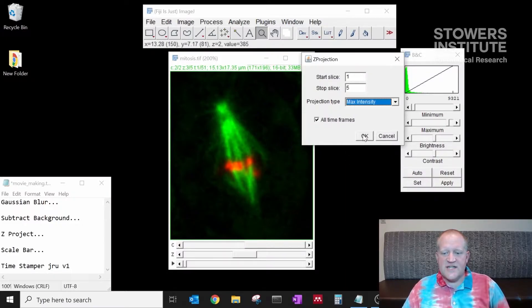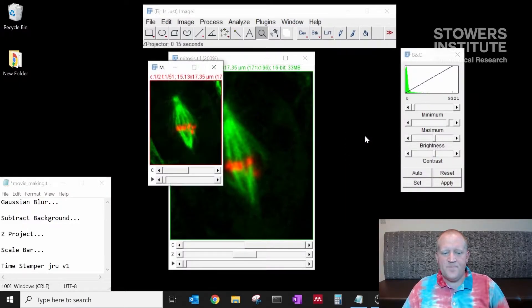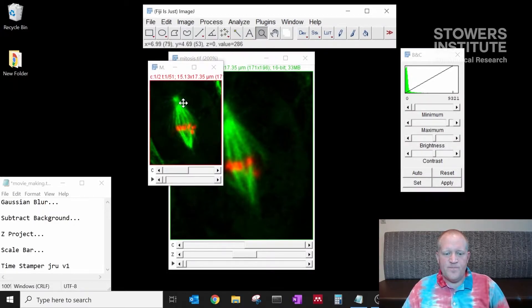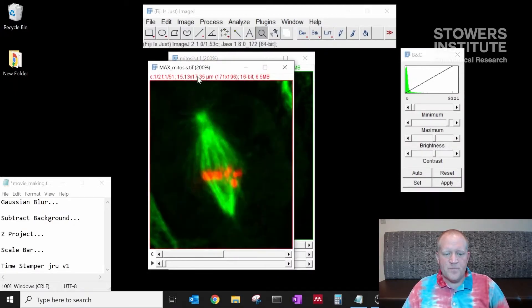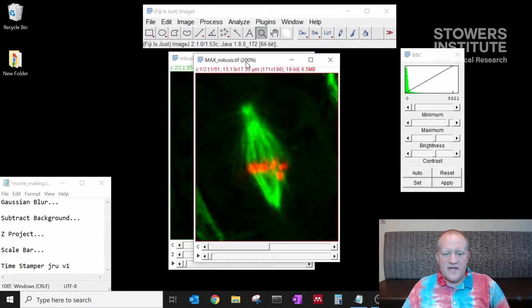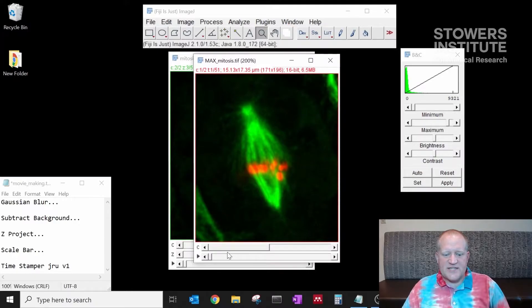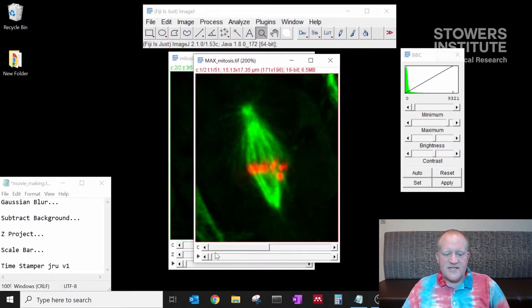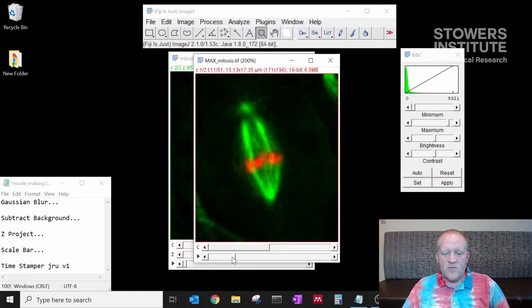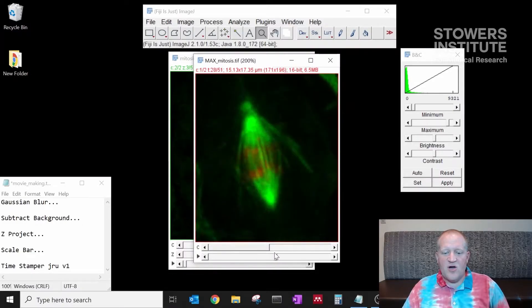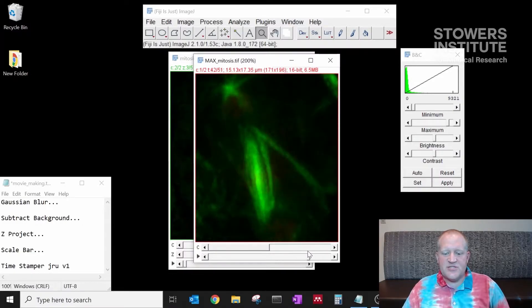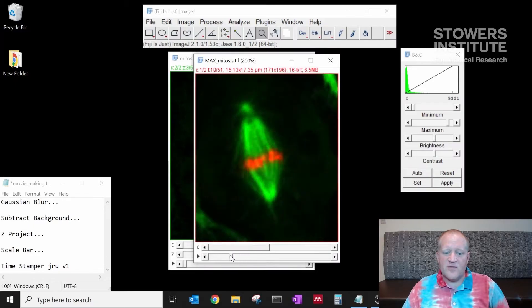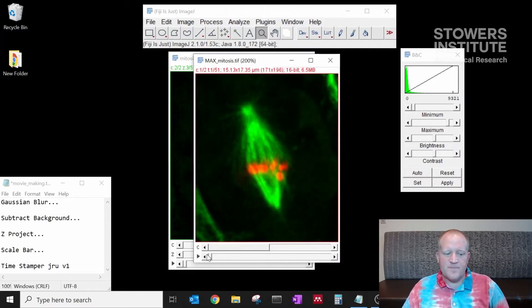Once this is all selected, click OK and now we have a new window that is max projected. You notice we've lost a dimension here at the bottom of our stack. Our z dimension is now gone and we can display all z dimensions at one time in one single frame through the course of our movie.